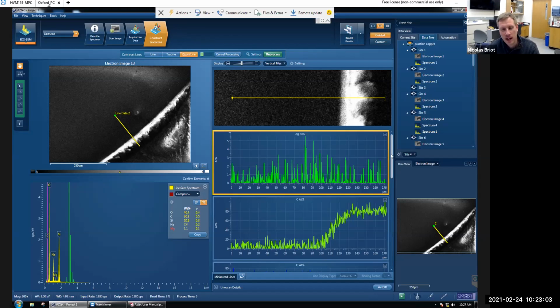Yesterday, I briefly looked at, let me stop sharing for a second, what it's acquiring. So we can just let it grow and see what happens. Yeah, you can see me. So yesterday I looked at those, right? Yeah, Tom, you tell me that I looked at the 5% silver, this one, potassium, this one. I looked at the surface. I could see silver. That one should definitely have silver. Is it the same as what we're looking at now in cross section or similar? Let me pull up the lab notebook. Because you have sample 2, right? Yeah.